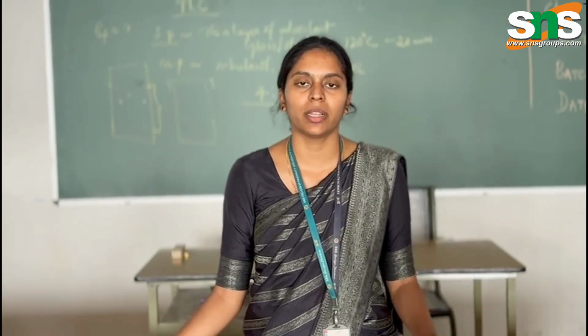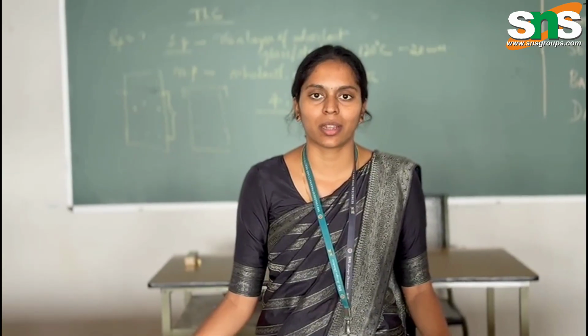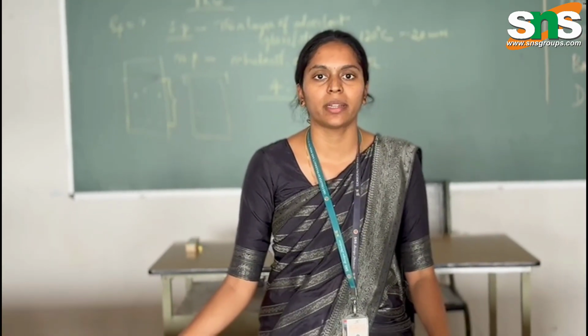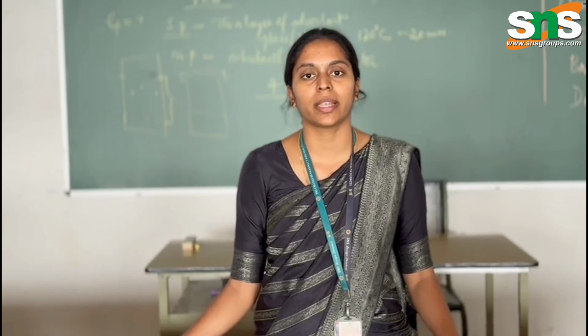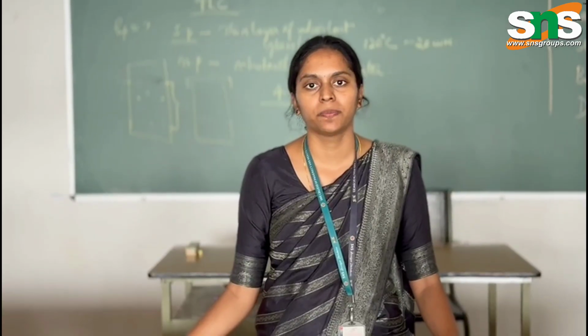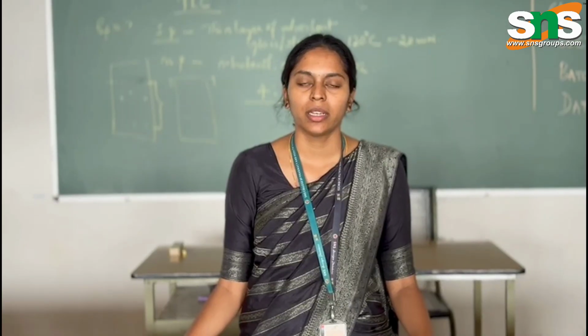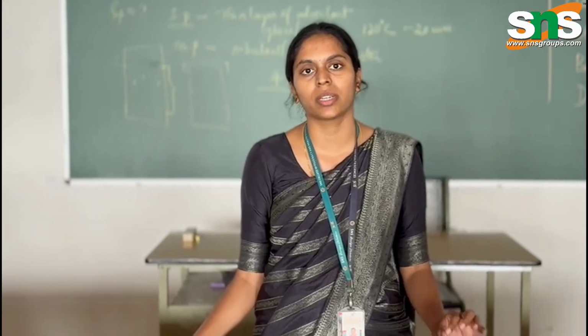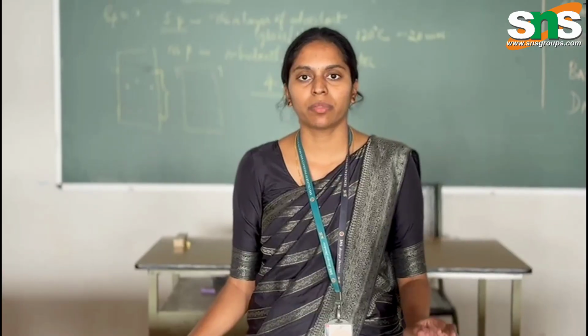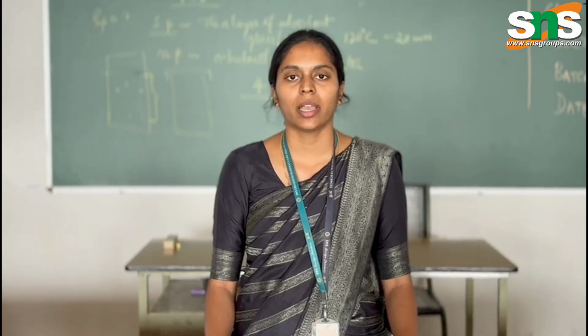Weighing balances are available in various sensitivities, and each one is weighed appropriately using that instrument. Then the second instrument is the nephelometer. The nephelometer is particularly used for checking the turbidity of a solution. The nephelometer is a part of nephelo-turbidimetry actually, but the nephelometer is used when the suspension has very low turbidity, and the turbidimeter is used when the solution has higher turbidity. With the help of this instrument we can measure the light scattered by the particles present in our solution, and with that we can indirectly measure how many particles are present in the suspension.